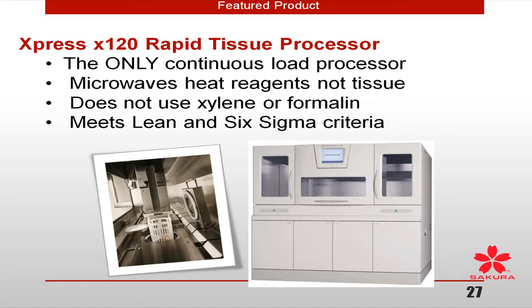Bill, one of the questions that we have is, have you looked at or have any knowledge of the TISPA tissue processor that uses supercritical CO2 to process tissue xylene-free? I have not had it in my hands.